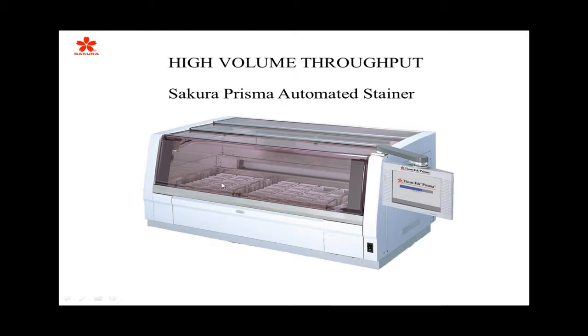Now, this is another high volume throughput stainer. The containers are much larger than the ones on the previous stainer that I showed you, which means that you have a lot more reagent that you can put in these.